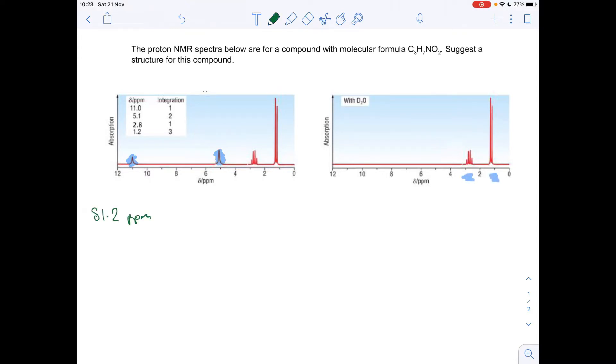So the first peak we'll look at is the one at delta 1.2. So this one here. We're just going to write down what we can say from that peak. So the first thing I would say is that it's a doublet. So we'll get that keyword in straight away. What does a doublet mean? It means there's an adjacent CH. It's got an area of 3. Therefore, the signal is being caused by a CH3. And the final thing we're going to say is the environment that it's in, it's from its shift value of 1.2. So we'll get off the data sheet. That's HCR.